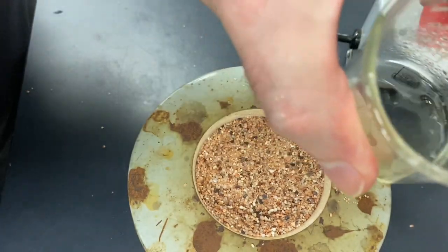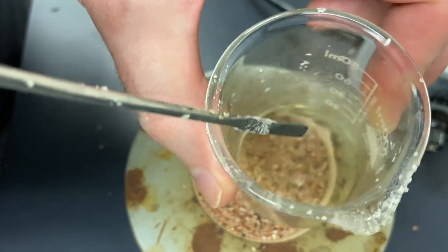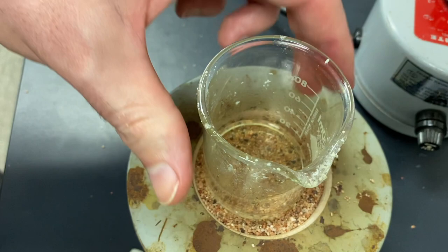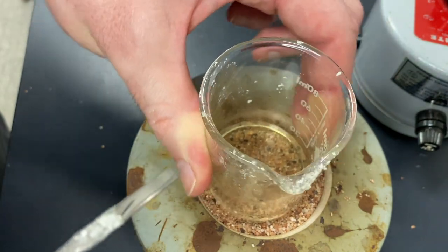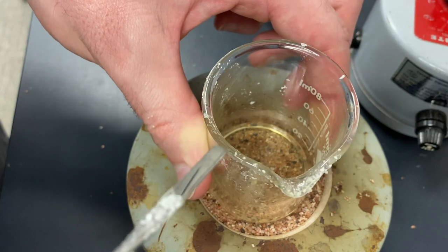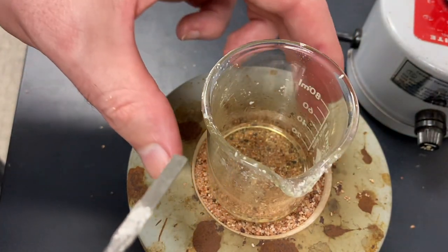So it looks pretty good. We get basically everything dissolved here. And we might want to just let this come up pretty close to boiling, or actually just a little bit boiling.